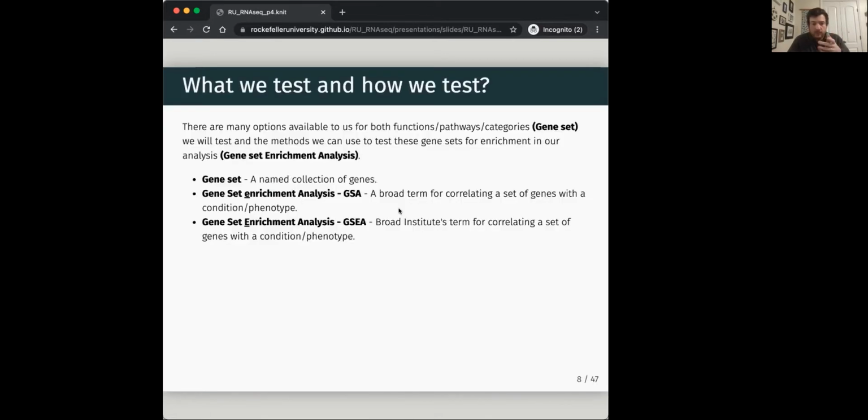And so there's lots of different kinds of gene sets, and there's lots of kinds of gene set analysis. And so people can sometimes get a little overwhelmed by this, because quite often the way people do GoTerm analysis is they'll just go to some web browser, and then you can throw in some gene sets, and then it gives you a result, right?